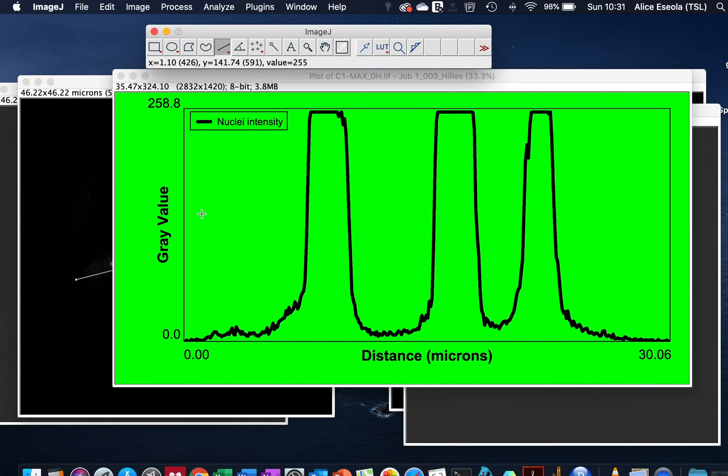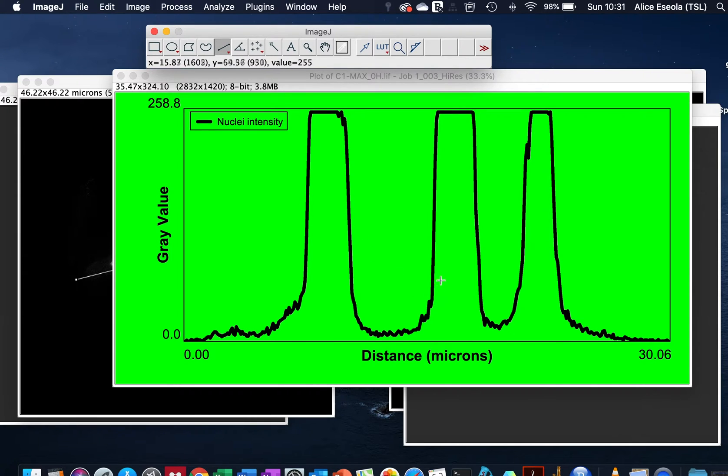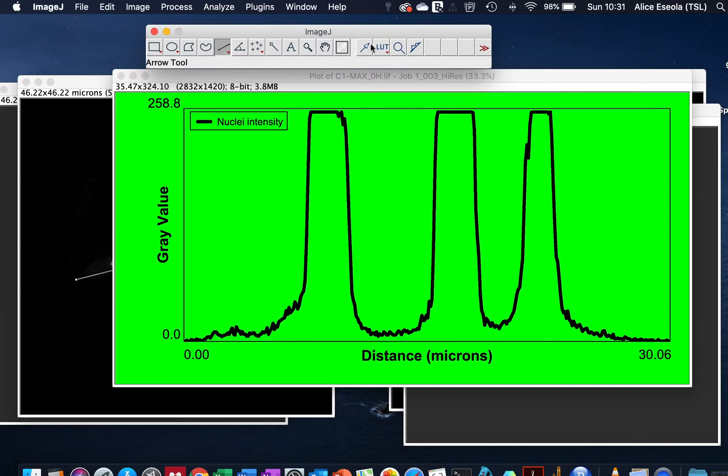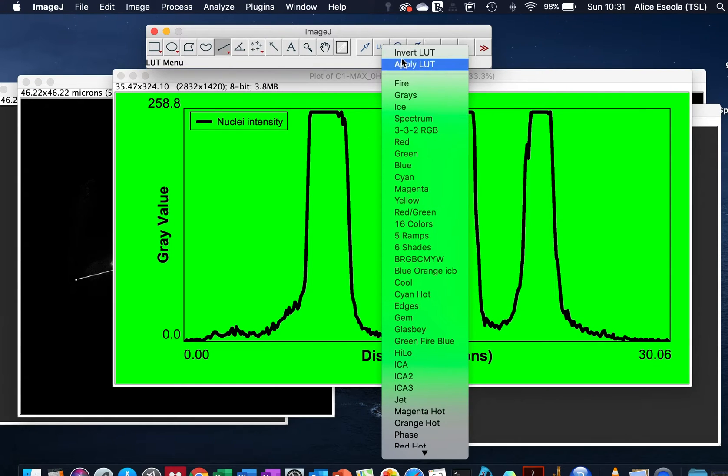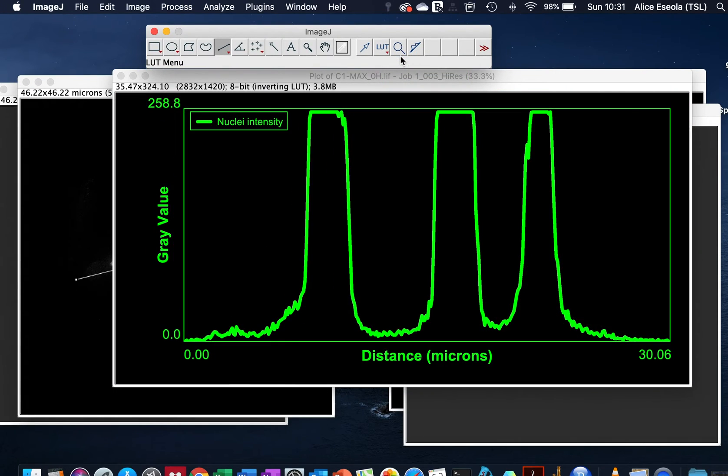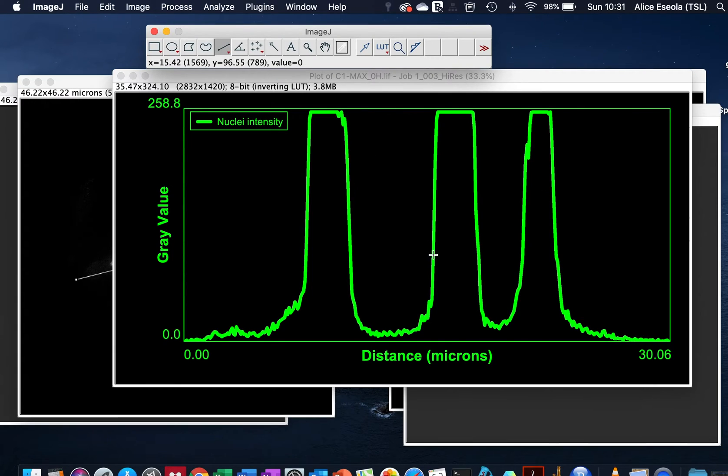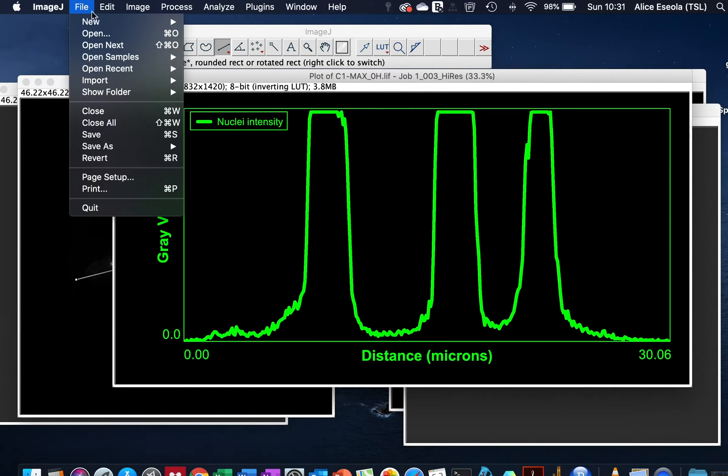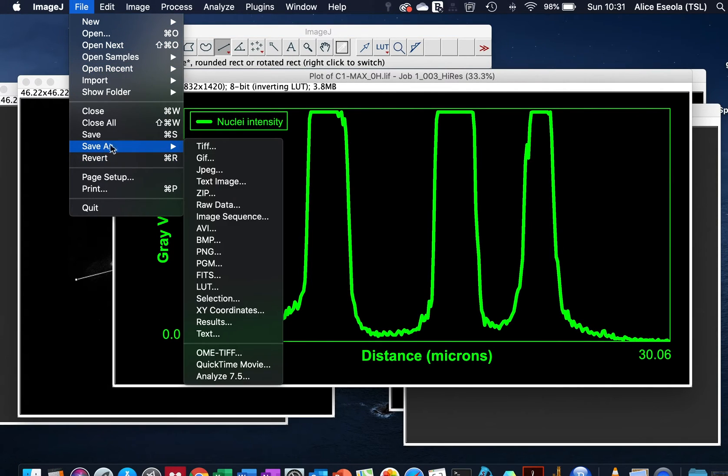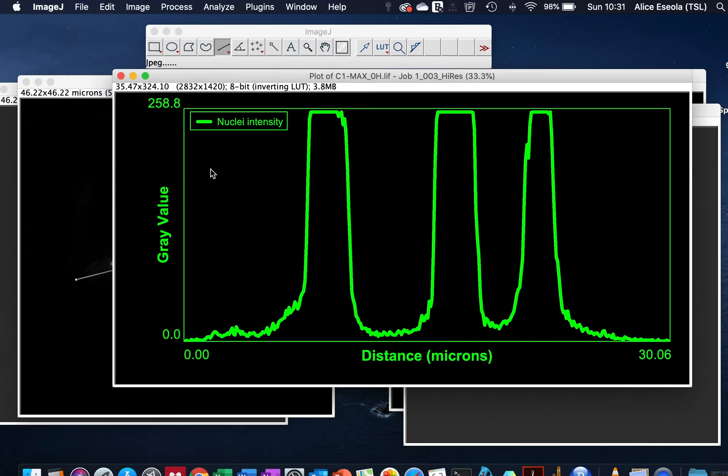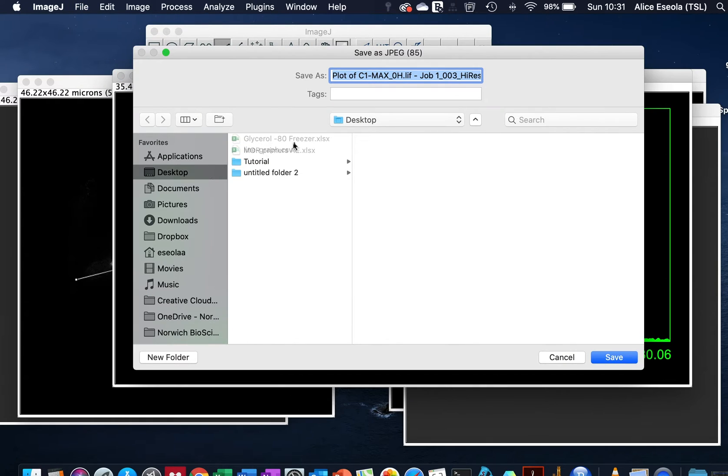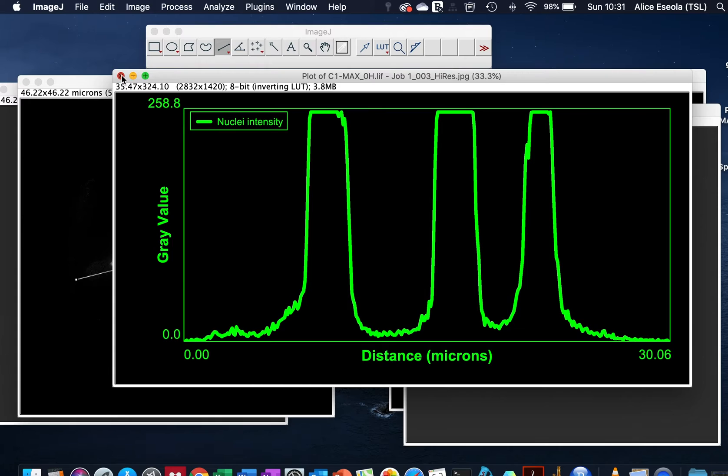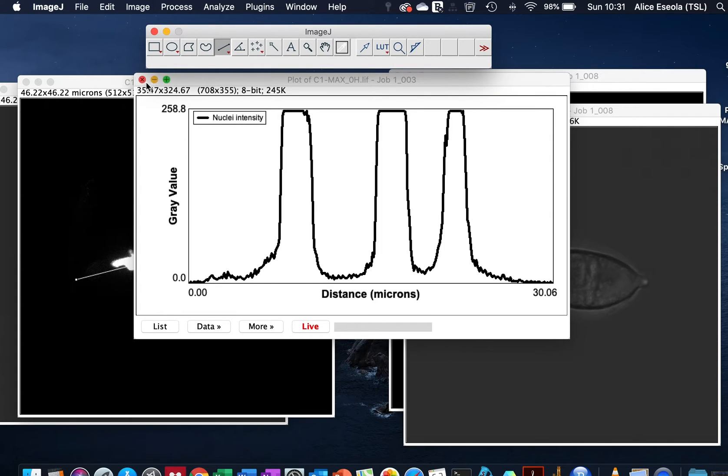You could see that when we selected green the background became green and the line plot is still in black. To invert this to have the line graph as green and the background as black, you just have to go to LUT, Invert LUT. Automatically it changes the background with the line graph and you have this beautiful plot which you can then save as a JPEG or whatever file format you prefer to work with.